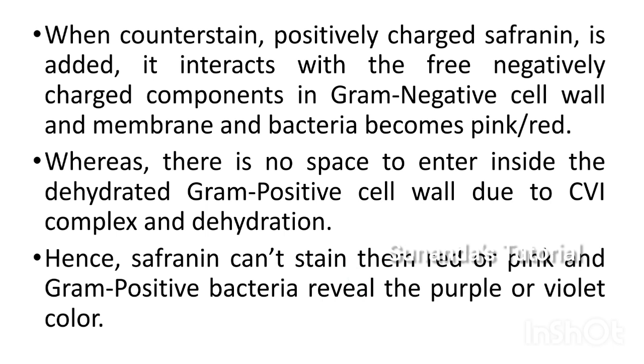Next, when the counter stain, positively charged safranin, is added, it interacts with the negatively charged components of the gram negative cell wall and membrane, and the bacteria become pink or red. Whereas there is no space to enter inside the dehydrated gram positive cell wall due to a strong CVI complex and dehydration in gram positive ones. Hence safranin cannot stain them red or pink, and gram positive bacteria reveal the purple or violet color.